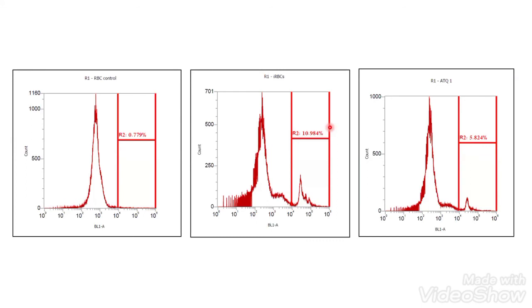But in microbiology, I think there are a lot of things which still need to be optimized, because we do not have specific proteins on microbes like on human cells. There are cell walls and they are nearly similar. Only 1 or 2 proteins are different, and how to use antibodies against them? So yes, many things should be optimized for microbiology. Right now, experiments checking whether 10 populations or 3 populations are there are going on in microbiology.